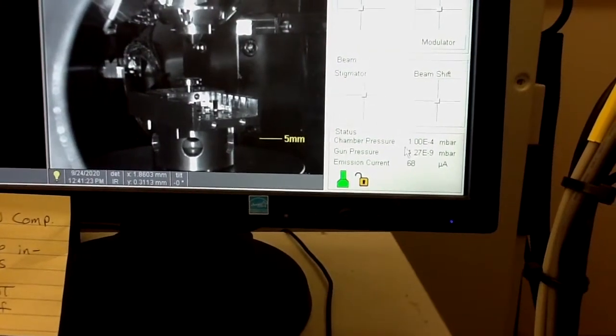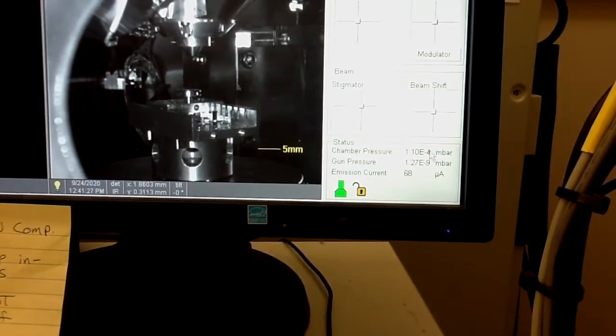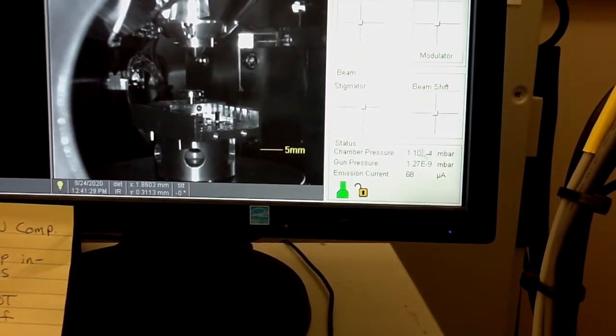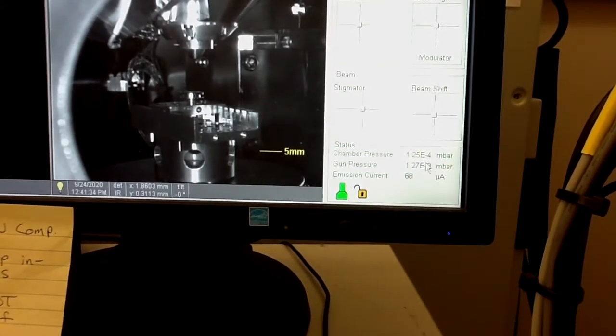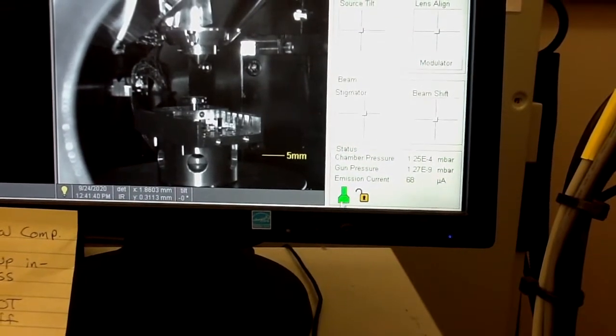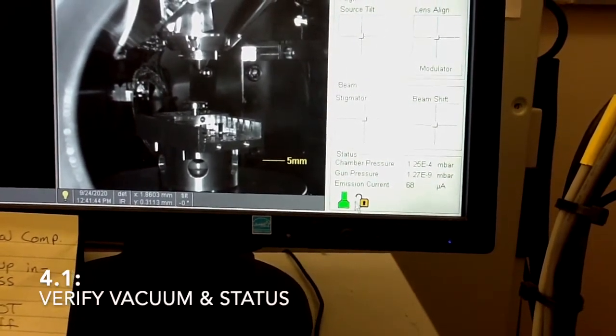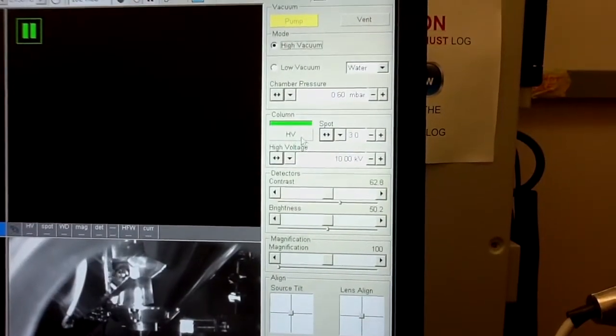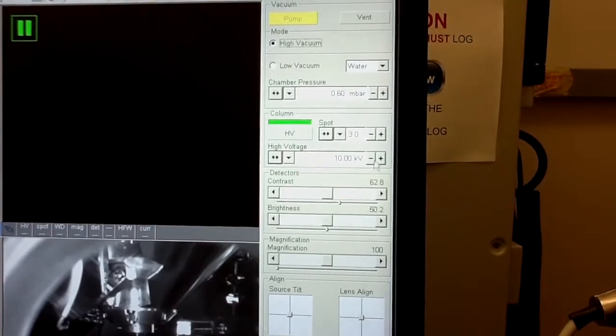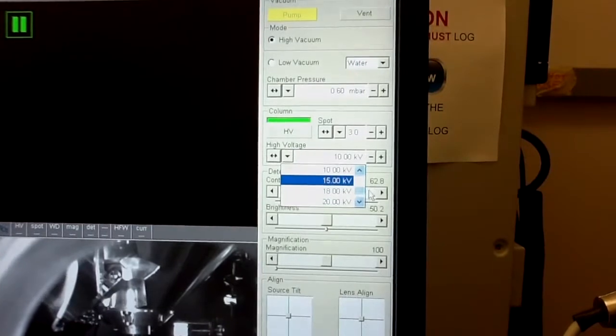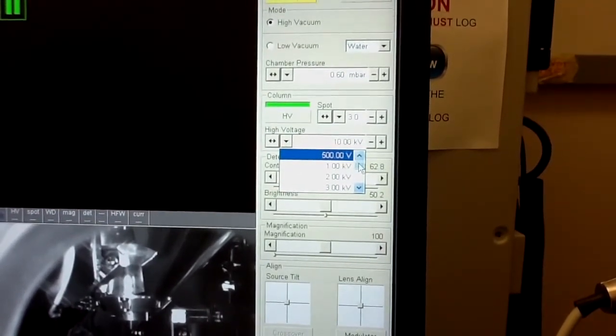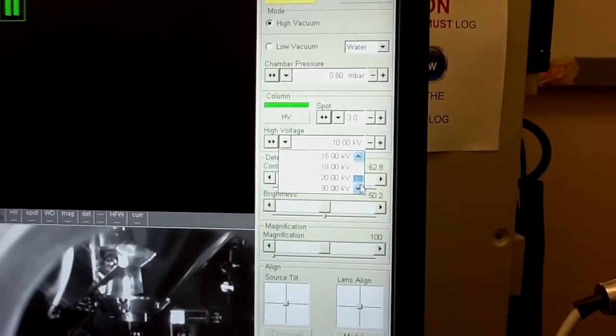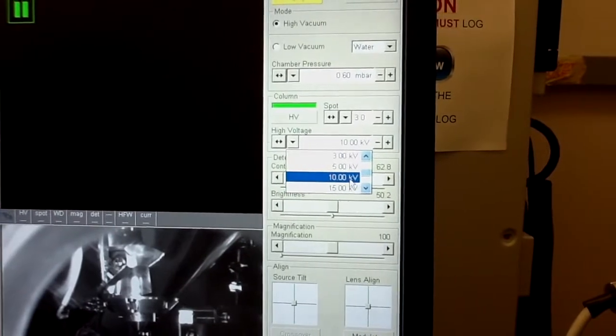After about two, three minutes, you should have this in low 10 to the minus four or high 10 to the minus fifth range. Of course, the gun pressure will be much lower 10 to the minus nine or 10 to the minus 10. Your immediate indication is the color of this icon. If it's fully green, it means that microscope is ready for the use. Now you are ready to turn on the high voltage. I would recommend to start with 10 kilovolts. You can also select other voltages, starting from 500 volts, which is very difficult to use, to 30 kilovolts.